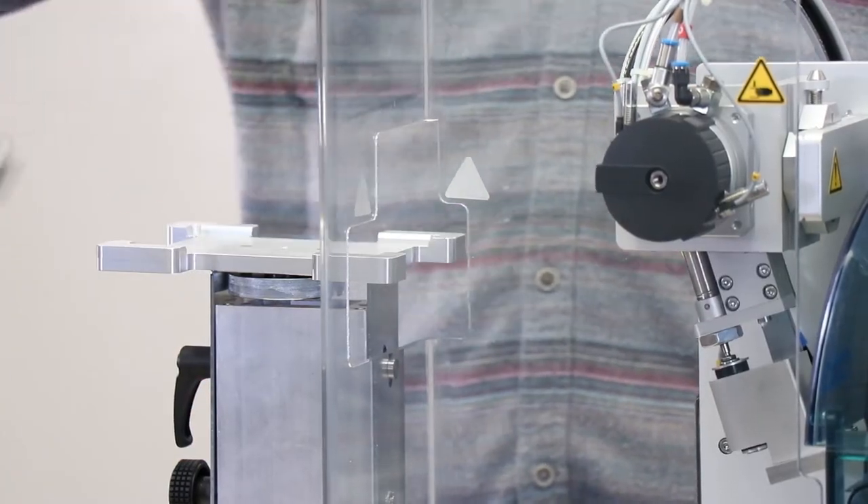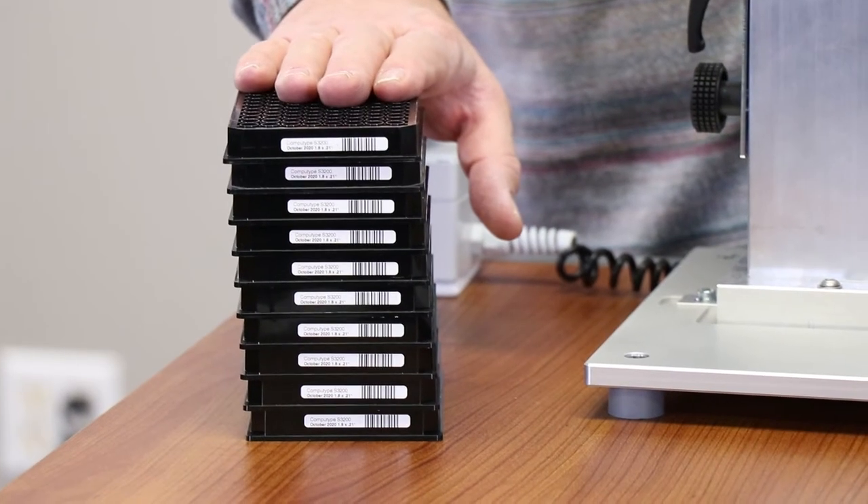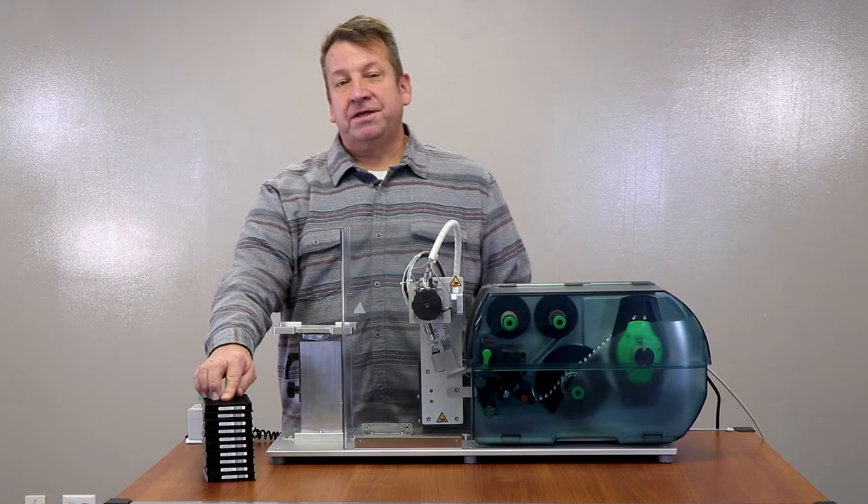So this is an example of the accuracy and the repeatability of this plate applicator, and it's far better than if you attempted this by hand.